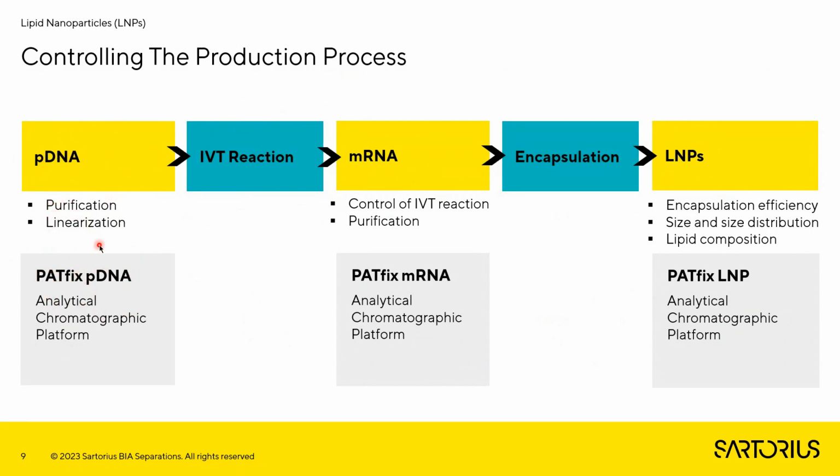Then, when we have a purified and linearized plasmid DNA, this plasmid DNA can go into the IVT reaction mixture where it serves as a template for synthesis of mRNA.